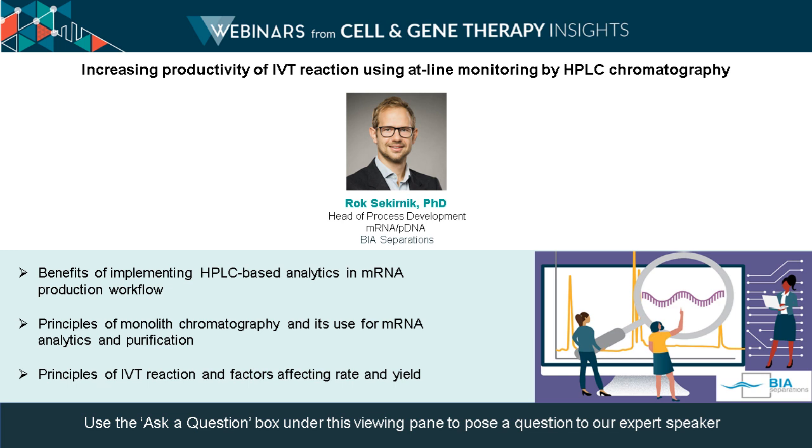Hello, and a very warm welcome to our Cell and Gene Therapy Insights webinar on increasing productivity of IVT reaction using at-line monitoring by HPLC chromatography. I'm Elisa Minotti, founder of BioInsights, and joining me today is Rok Sekirnik from BIA Separation, part of Sartorius, who will be discussing the application of an HPLC-based technology using a multimodal ligand based on anion exchange ligand to monitor the IVT reaction. The method allows for simultaneous quantification of NTPs, capping reagents, plasmid, and mRNA within 3.5 minutes.